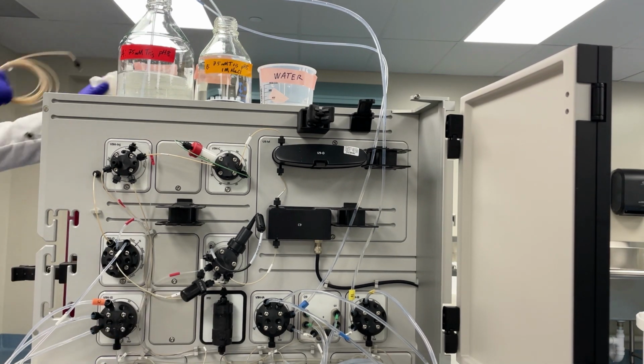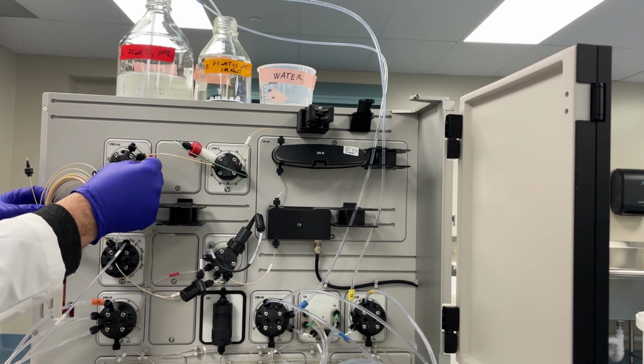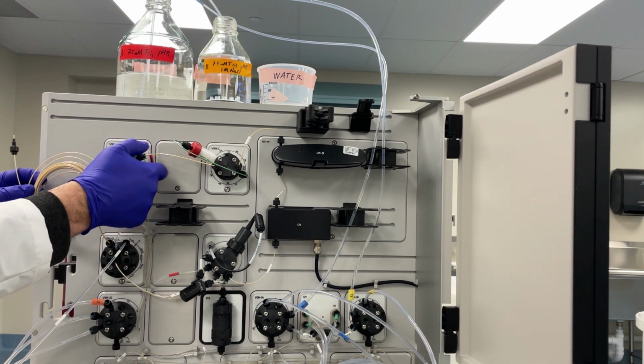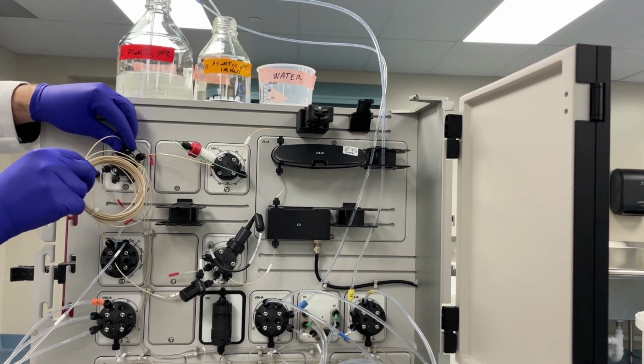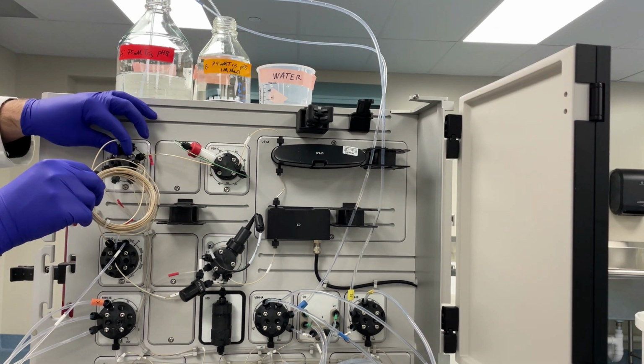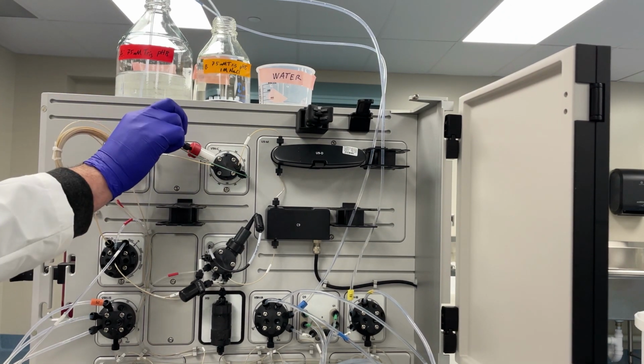Okay, now I'm going to grab the sample loop. In the injection valve, I'm going to plug the bottom of the sample loop into position loop E, and then the top of the loop into position loop F. Once I've done that, I'm going to check all the connections I've made, make sure they're nice and tight.